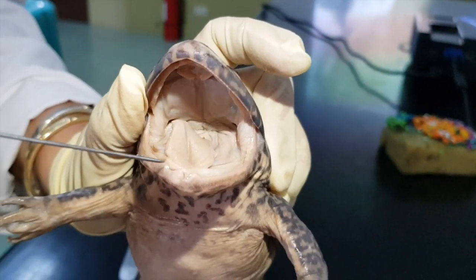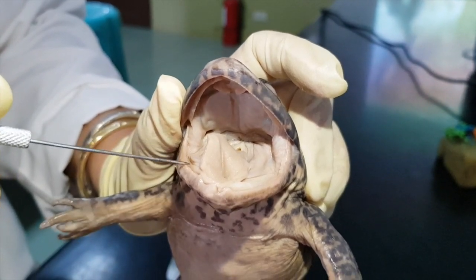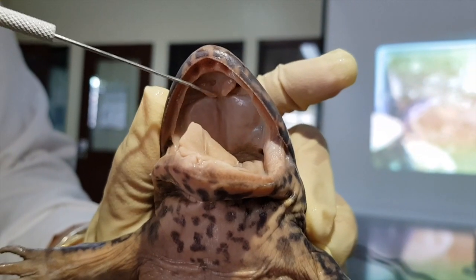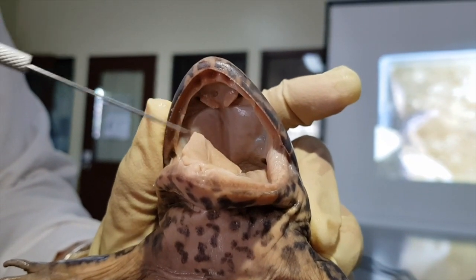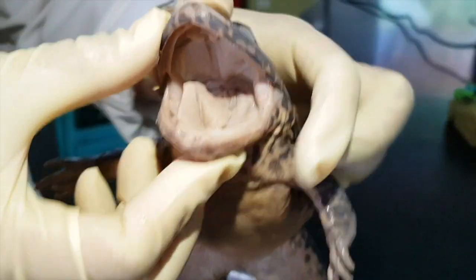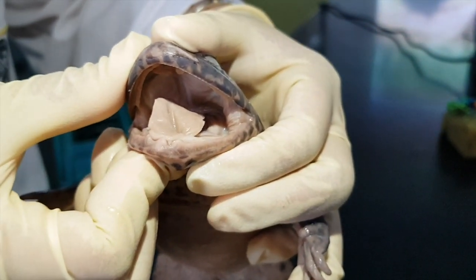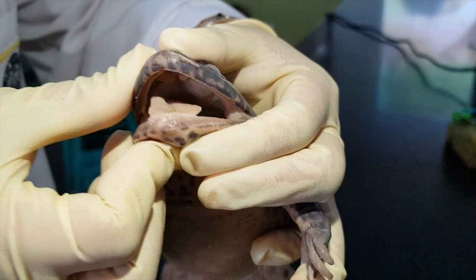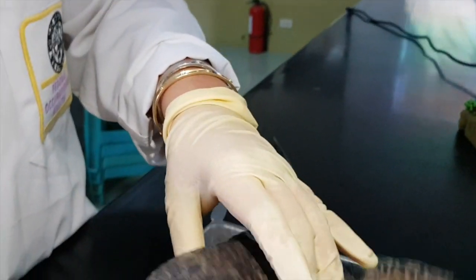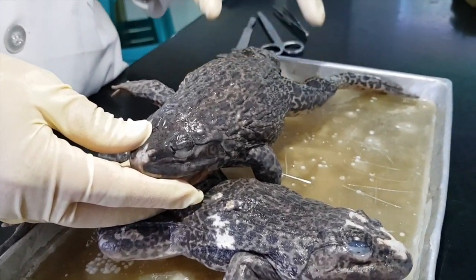And of course, these are the maxillary teeth. And on the surface here, if you touch it, there are also vomerine teeth present. All the other parts here give a closed hinge for frogs when they close their mouth. It's very important so that food will not escape when they capture it. So we're going to prepare it for dissection, but first you skin the frog.